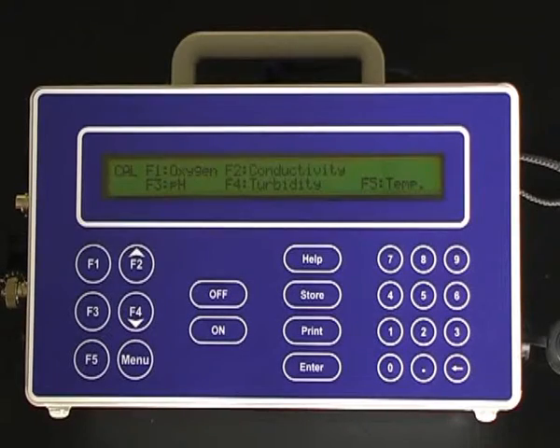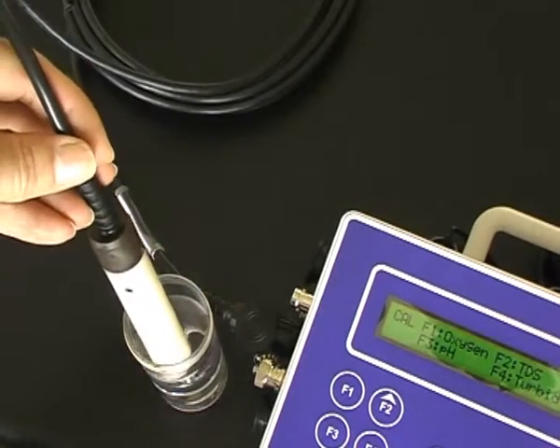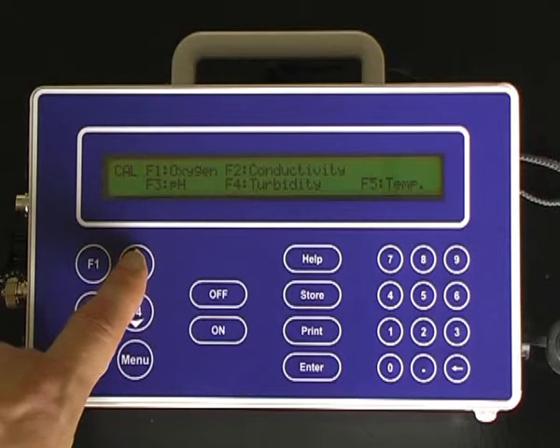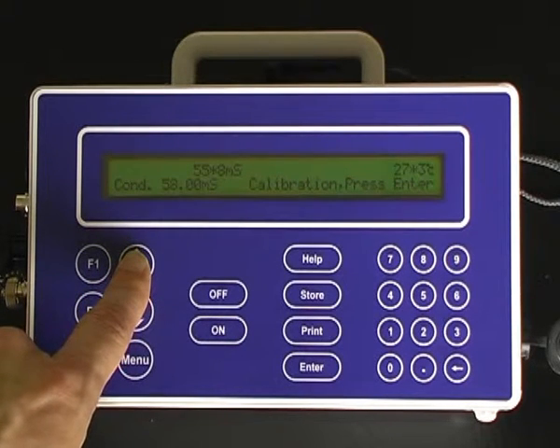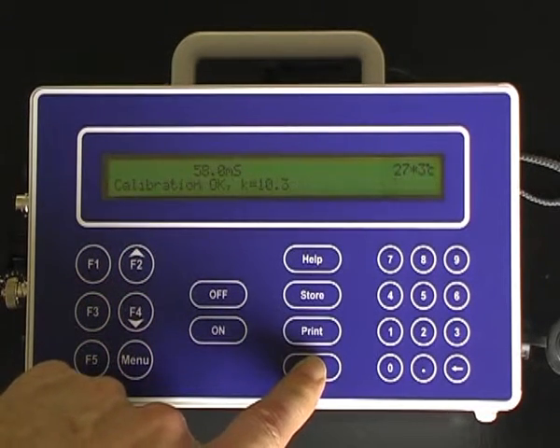For the second point calibration, ensure that the sensor is submerged past the vent hole in the solution. Press F2 for conductivity. Once the sensor has equilibrated, press the Enter button to complete the second point calibration.